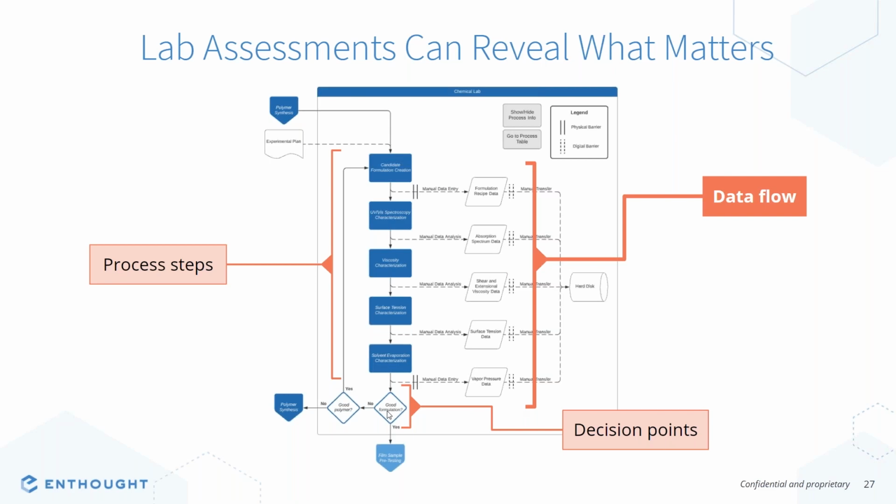And then where are the critical decision points along the way where I decide what to do and where to go next. For moving to stage 2, it's really important to take a look at the data flow, right? Because the first step is to get data organized.